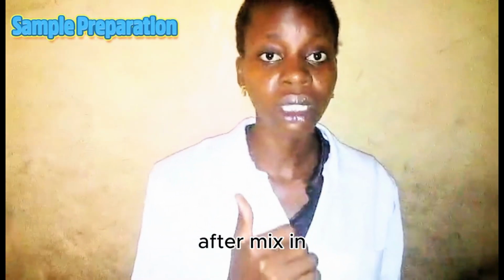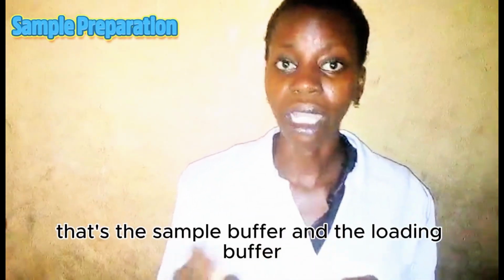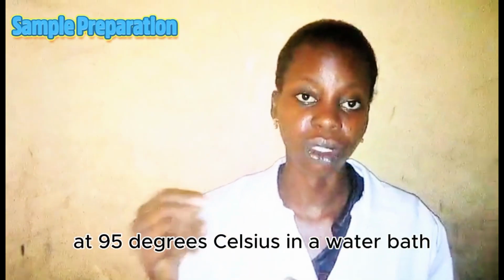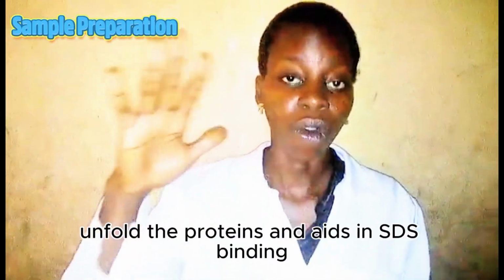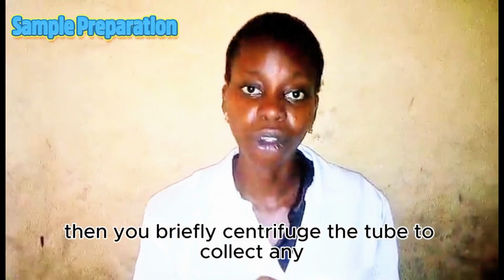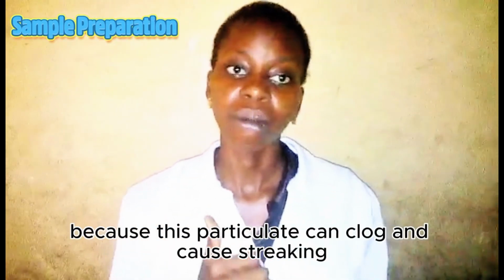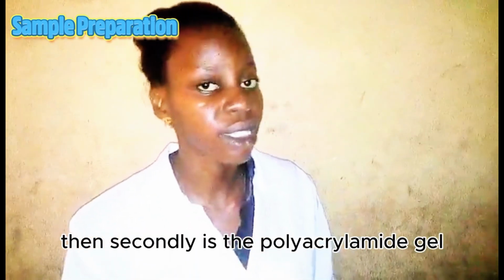After mixing the above mentioned, that's the sample buffer and the loading buffer, you add them to the protein samples and heat them up for 5 minutes at 95 degrees Celsius in a water bath. The essence of this heating process is to help to completely unfold the proteins and aid in SDS binding. Then you briefly centrifuge the tube to collect any condensation from the lid and pellet any insoluble particulate matter, because this particulate can clog and cause streaking. Then secondly is the polyacrylamide gel.